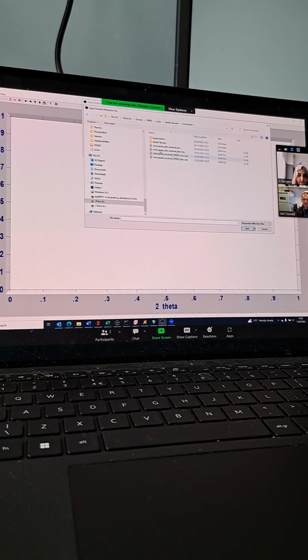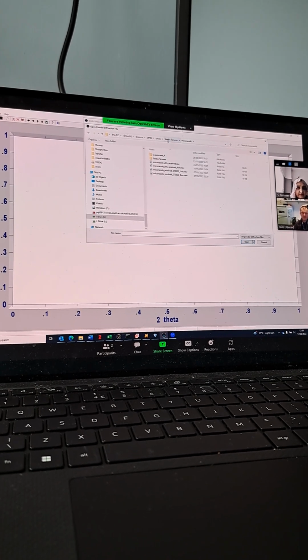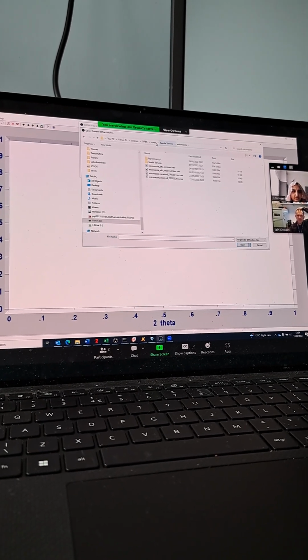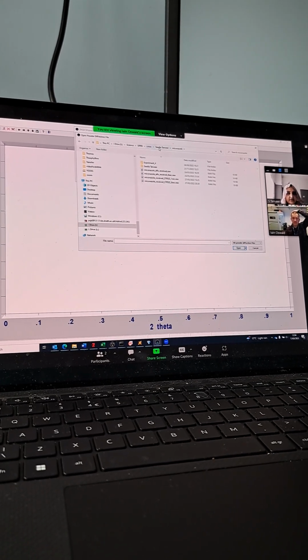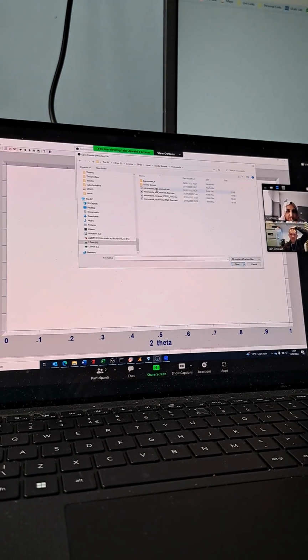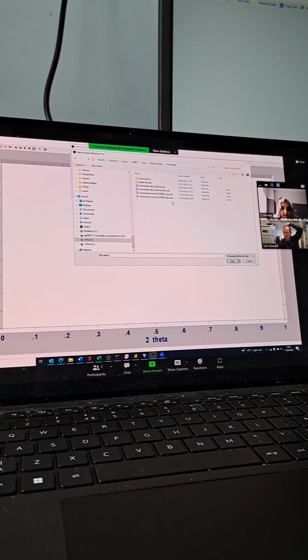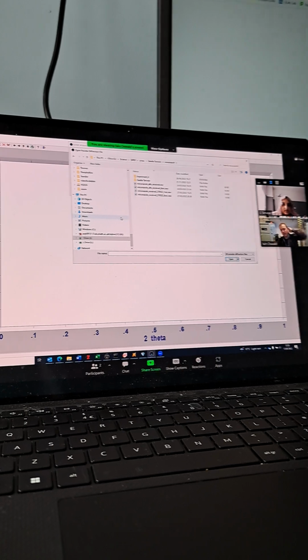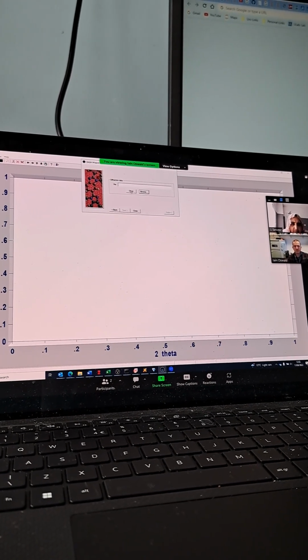Miconazole, is it? It was on C drive, like you saved it in C drive. Are you looking for the data? Yeah, you saved it in C drive. Yeah, this is on my PC though. C drive is in your PC. It's okay. So what we can do then is we'll just open up one of these files.